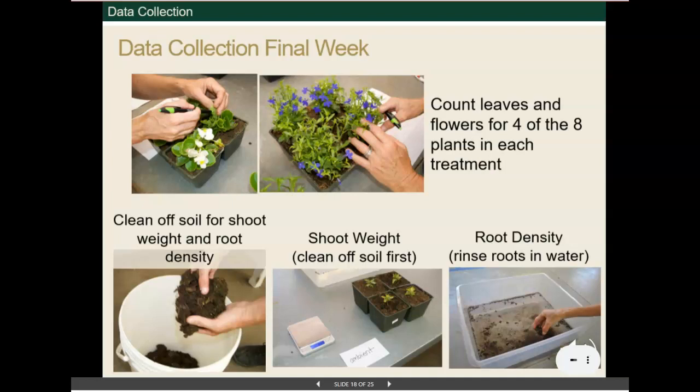After cleaning the roots, we applied a score of between 1 and 5 to measure root density, 1 being the smallest root density and 5 the largest. This may seem arbitrary, but it's actually a very common method, sometimes used in plant pathology. Pathologists will observe disease symptoms on plants and rate them on a scale between 1 and 5. 1 being a plant showing very mild to no symptoms, and 5 is a plant that's completely dead. As long as you are consistent with assigning the scores, this is an adequate way to report the root density data.